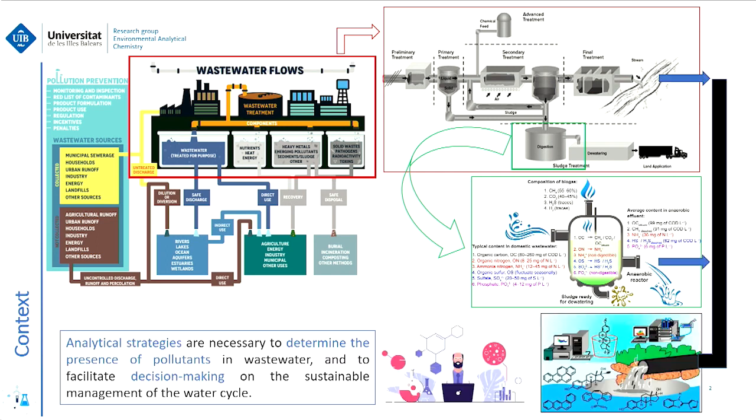For this reason, analytical strategies are necessary to determine the presence of pollutants in wastewater and facilitate decisions on the sustainable management of the water cycle.